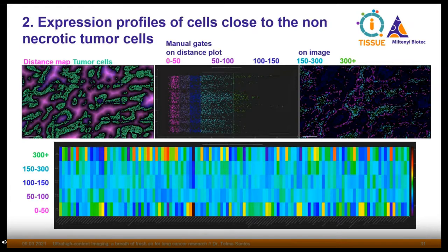And here you could see then that they showed to have different markers expressed. Actually, you could see that, for example, here we have some CD38 and CD147 very active. CD38 interacts with extracellular proteins, and as I said before, CD147 is an extracellular proteinase inducer, so it can explain that these are the cells that help the tumor cell expand.